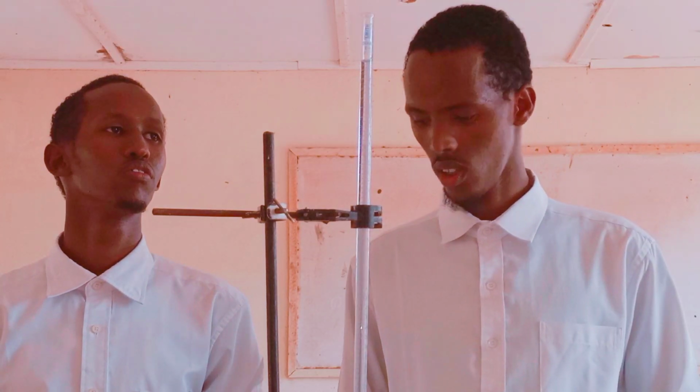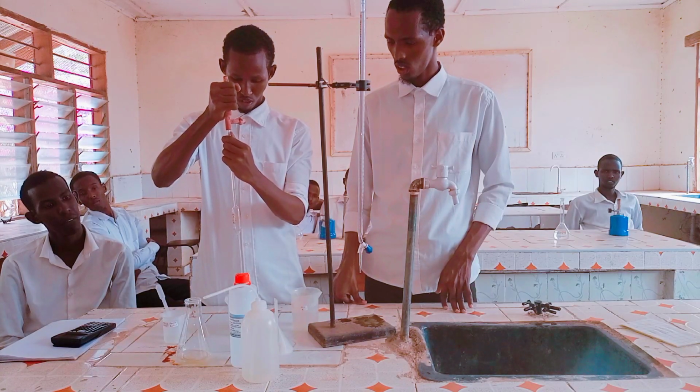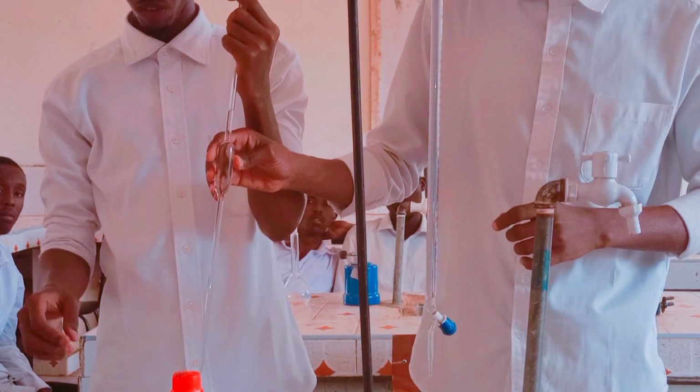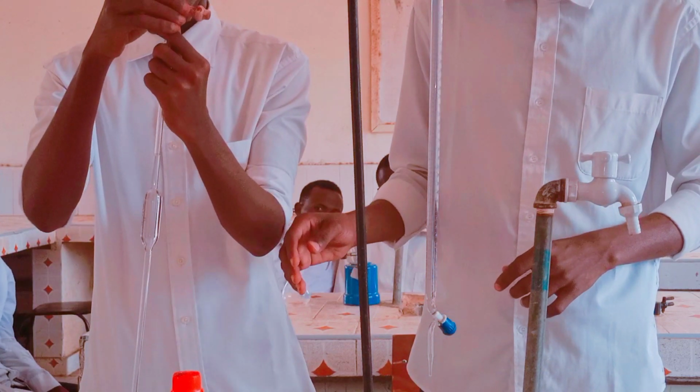The next procedure is we pipette solution L. Now we have pipetted solution L, we run it into the conical flask.